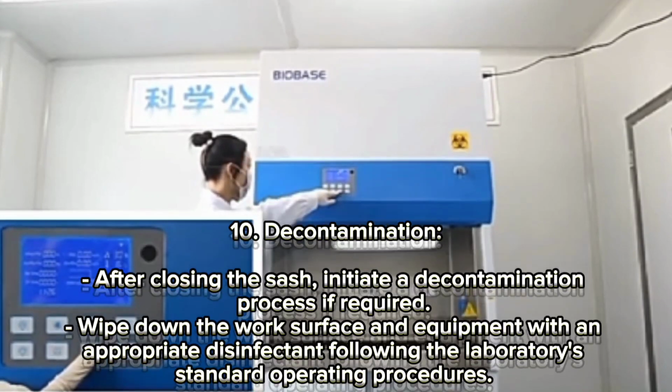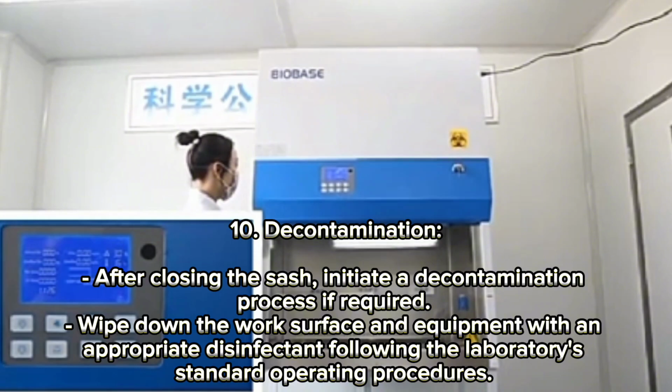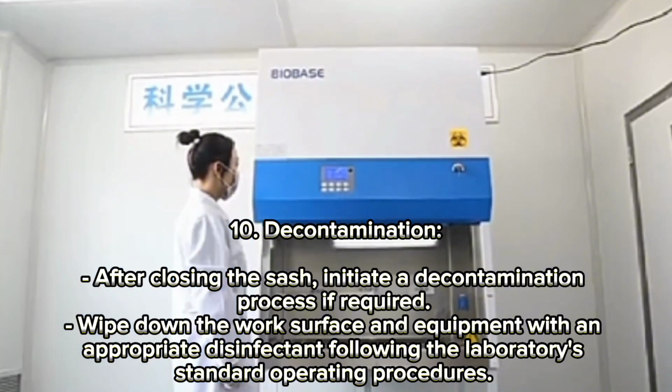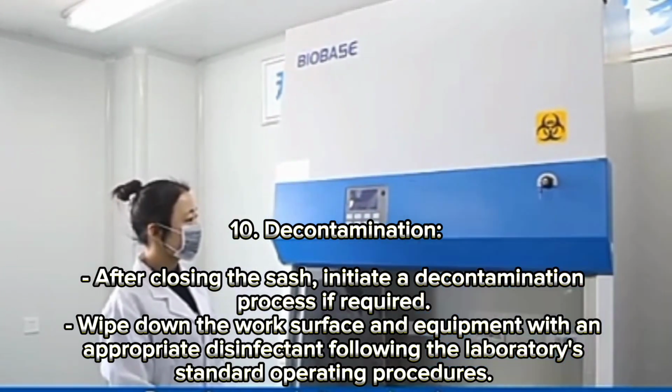The next one is decontamination. After closing the sash, initiate the decontamination process if required. Wipe down the work surface and equipment with an appropriate disinfectant following the laboratory's standard operating procedure.